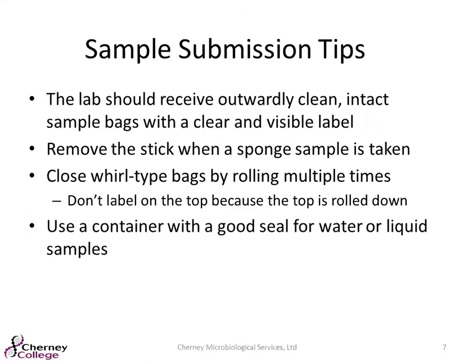And then again, use a container with a good seal for water or liquid. Not recommending sending Whirlpak bags for liquid samples unless you are dropping them off to us, because typically those will be leaking and then we will be calling and telling you that we need a different sample. Another thing here too, don't overfill your bags. Sometimes in shipment, when they get weighted down, those samples will start to leak out of those bags. And there again, the sample is compromised and you want to make sure that integrity is maintained.